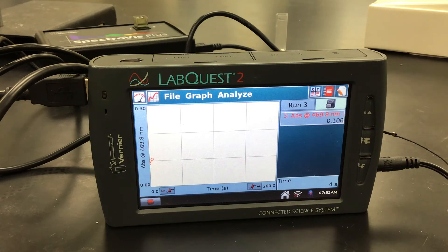All right. So we've got our absorbance going and we'll let this run its course and check out what our graphs look like and then go through our analysis once we can look at all of those together. All right.